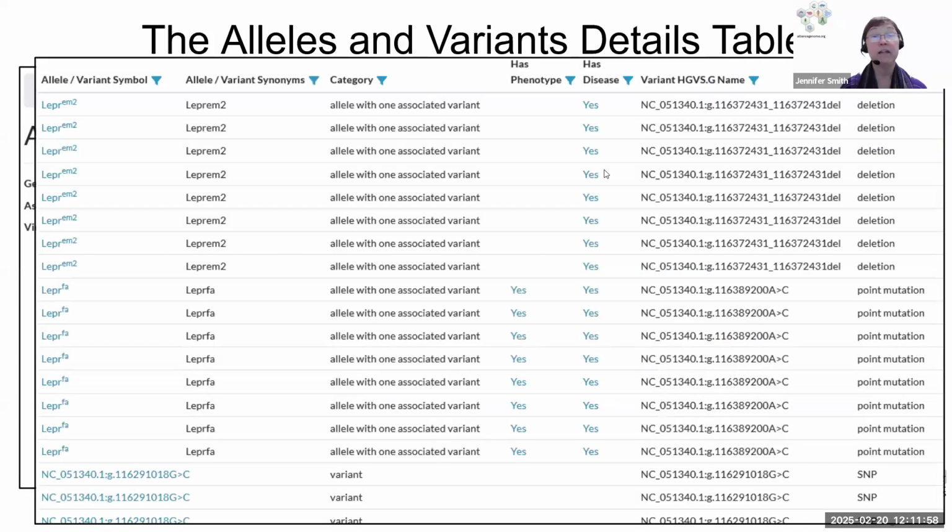And then below that, there is a table that gives many more details about the variants in particular. So the first 7 columns of the table, the first 7 columns at the top of this table, give records associated with variants.